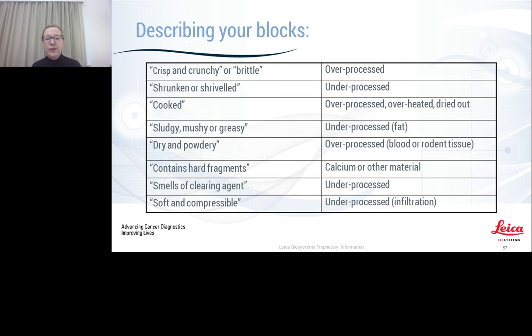It can often help to describe your blocks too. So we often use words like crisp or crunchy or brittle. It's often better to be much more descriptive. Really think about your macro effects, really think about your micro effects. Think about the terms you're using to describe the tissue.